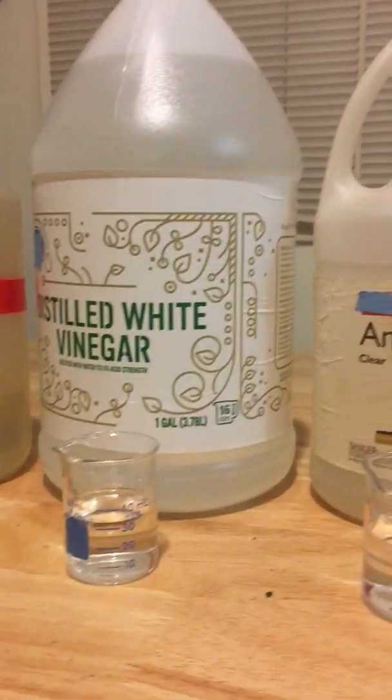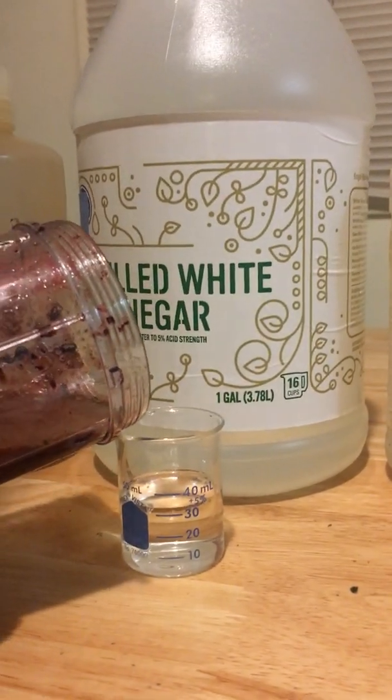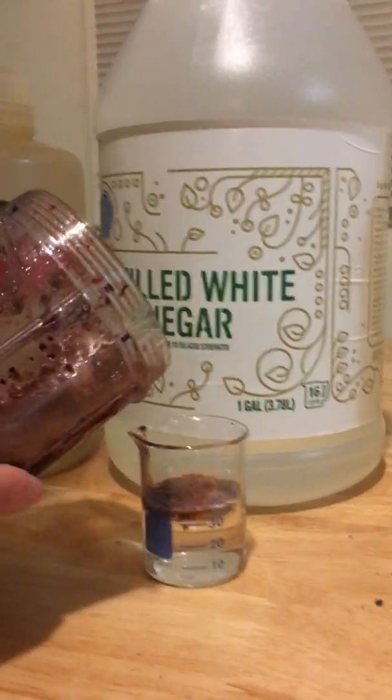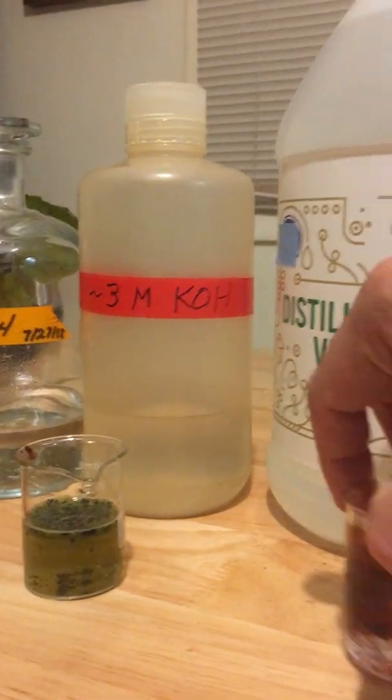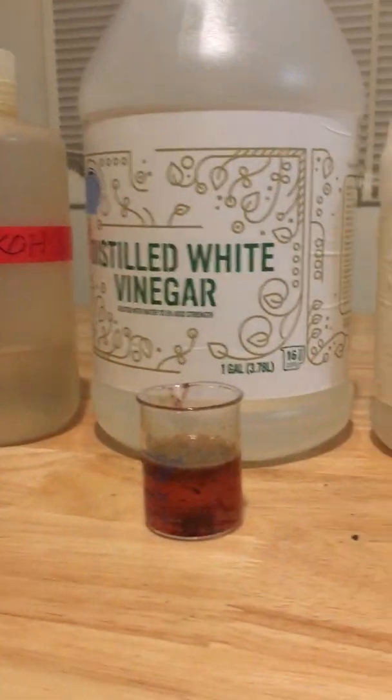So now we're going to move on to vinegar. I'm going to pour this into the vinegar solution. We swirl that in and we can see that it has sort of a reddish color, much like the sulfuric acid was a reddish color.